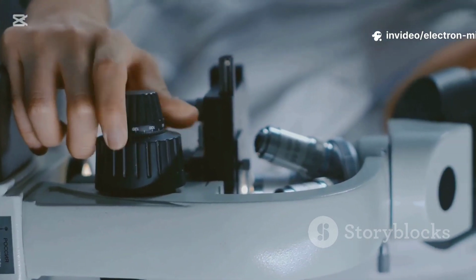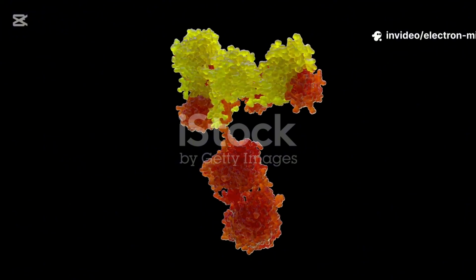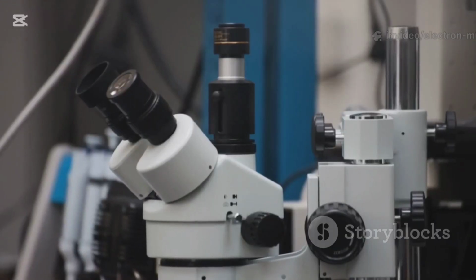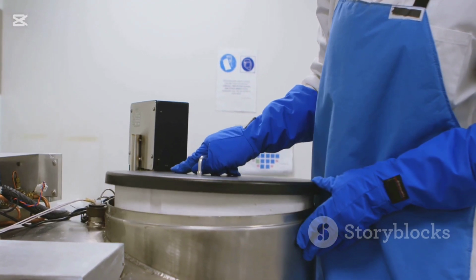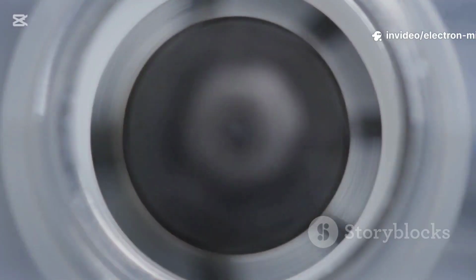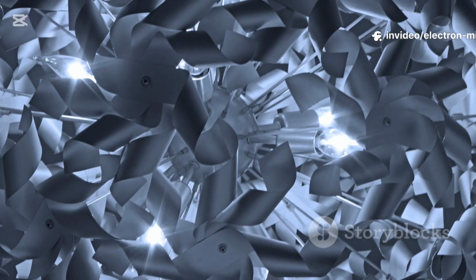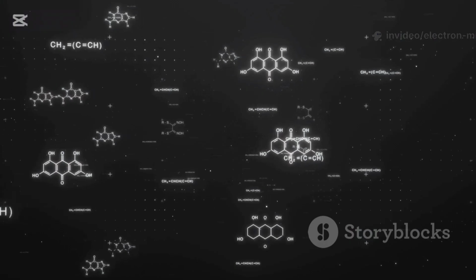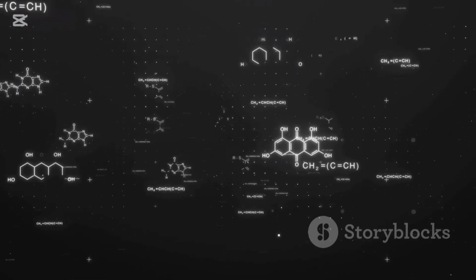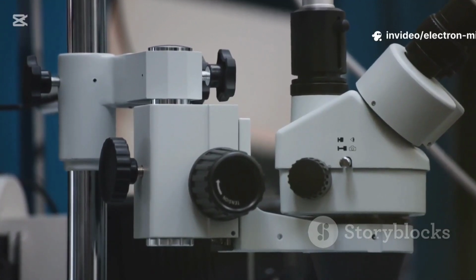In materials science, SEMs reveal metals, polymers, ceramics at failure's edge, spotting microcracks before catastrophe. TEM shows nanoscale phases to design stronger alloys. In chipmaking, features are smaller than light can see. SEMs inspect circuits, find defects, and tune processes. From welds to powders, EMs guard quality across industry. Snapshots from an endless album of discovery.